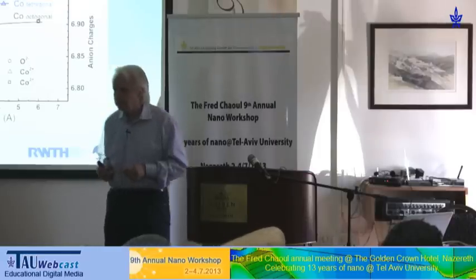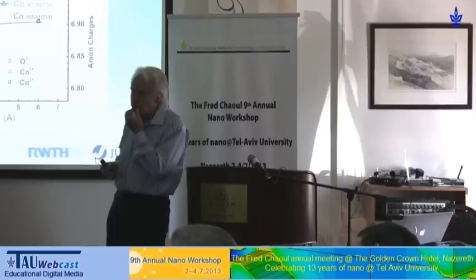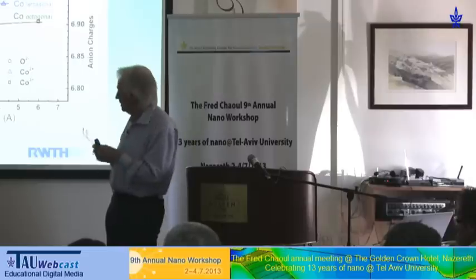The second question about the lanthanum aluminate strontium titanate interface. Did you try to measure more than one unit cell? Because usually people say that this strontium lanthanum intermixing occupies about 1 to 2 unit cells, and conductivity appears only above 5 unit cells. That's correct.